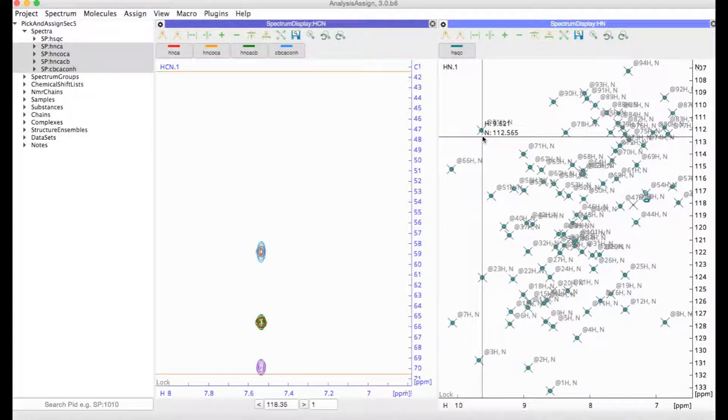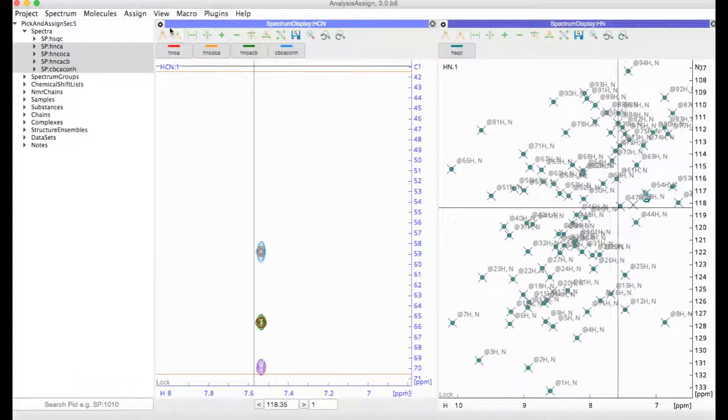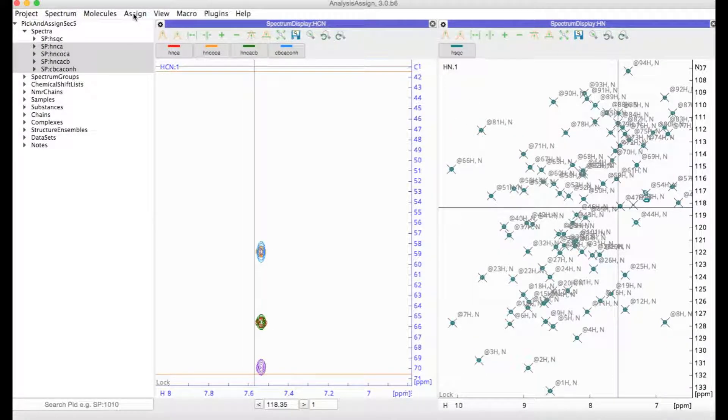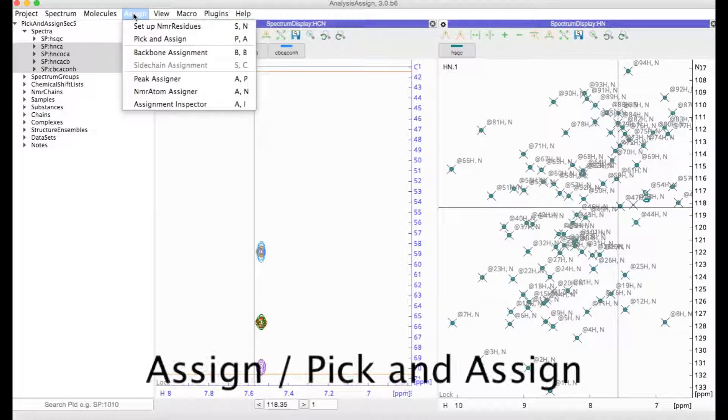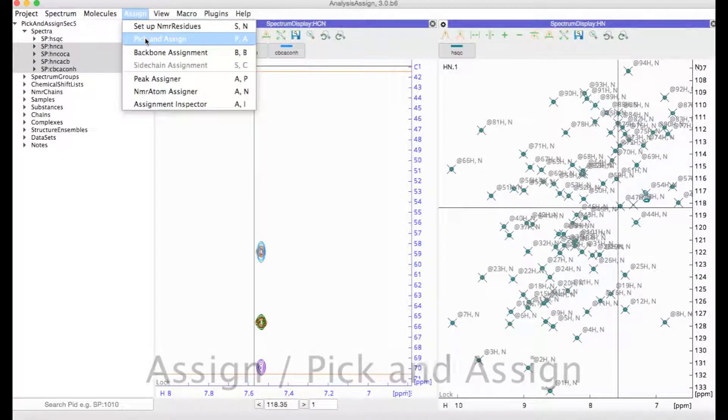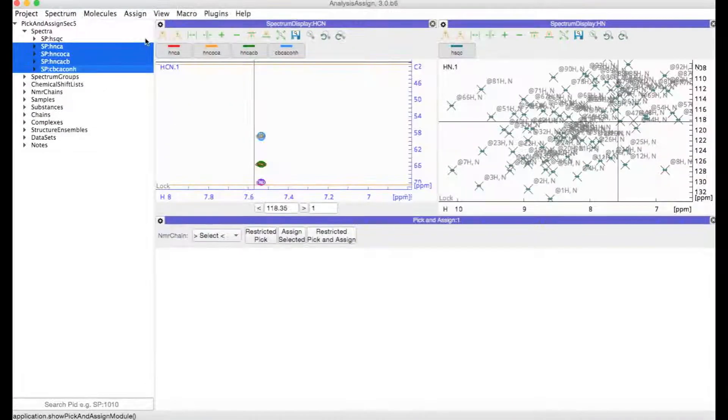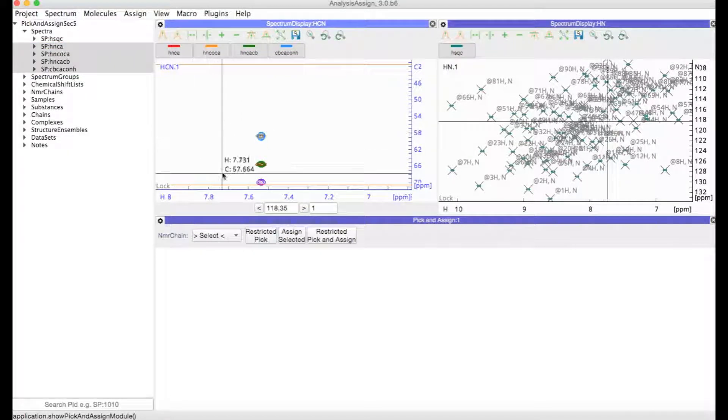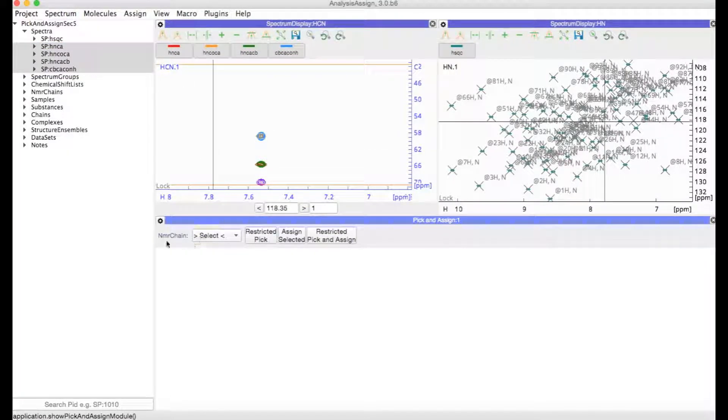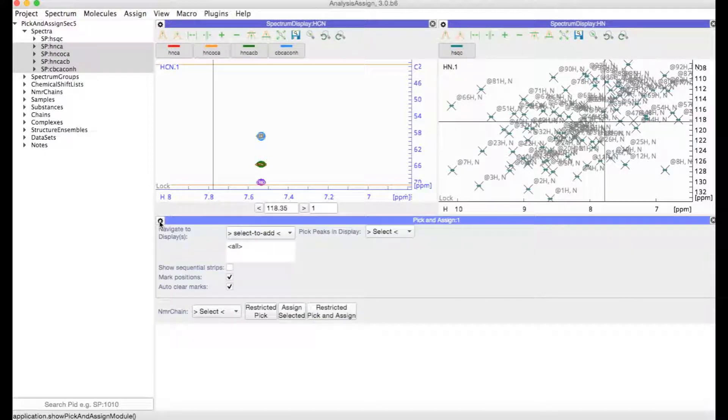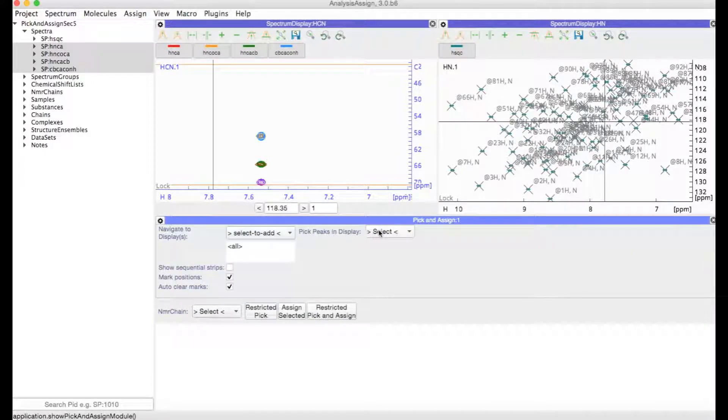So a better way is to use our Pick and Assign module. Go to Assign and then Pick and Assign, or type PA for short. Here, start by going to the settings menu by clicking on the gear icon. Then pick peaks in display.